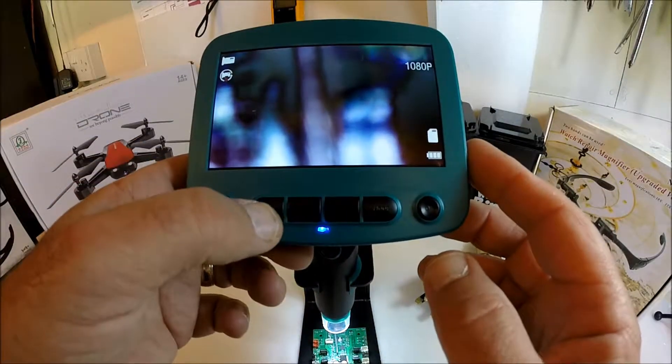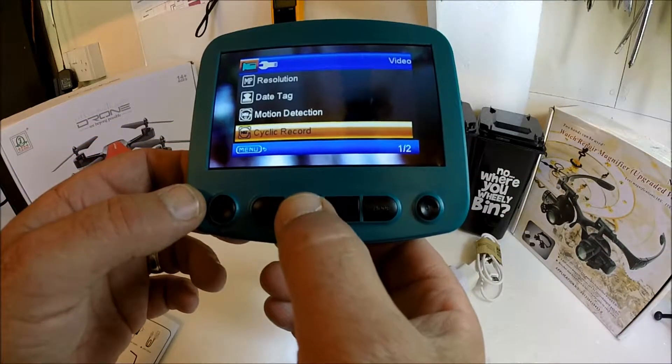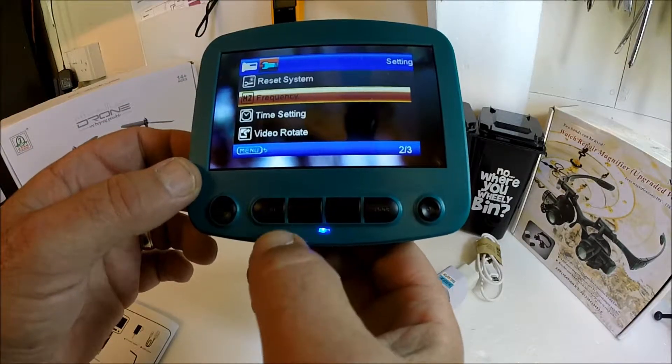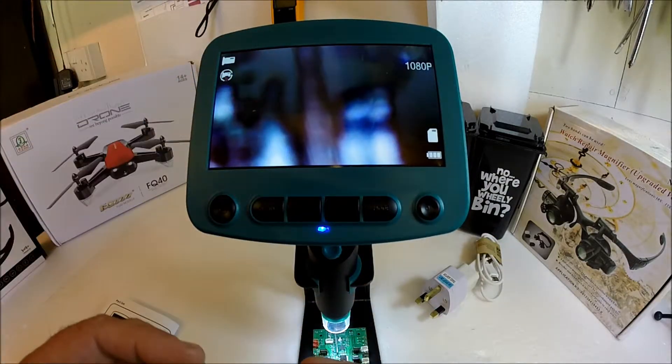We'll briefly go through the menu. You can see you have all your standard functions that you would normally get. Press menu again and you can go into your settings. Press menu again and you can go back onto your main screen.